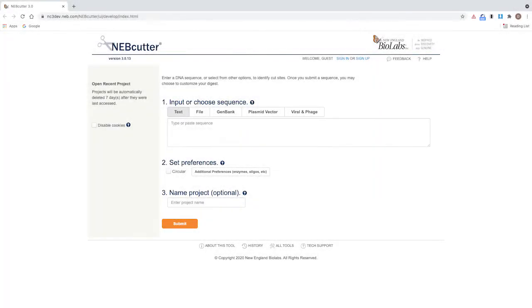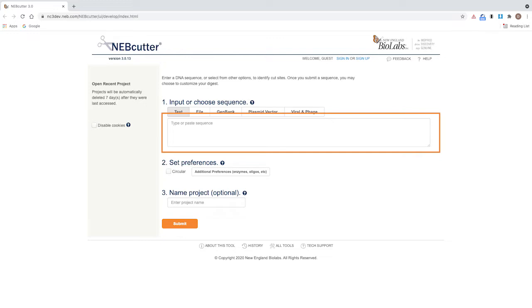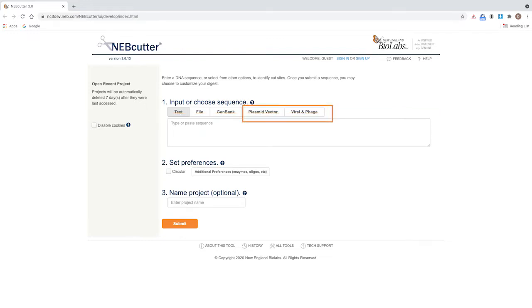If you have a sequence you would like to analyze, you can paste it in the DNA sequence box. You can also select from frequently used plasmids and phage genomes or select from a previous project.